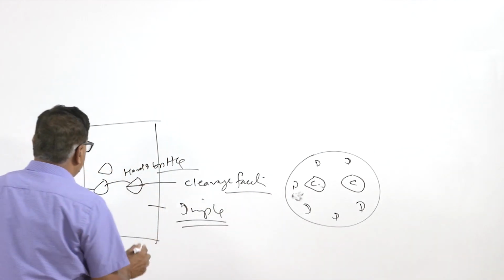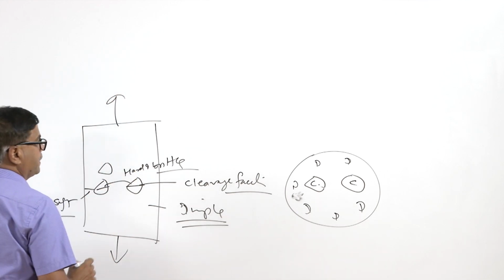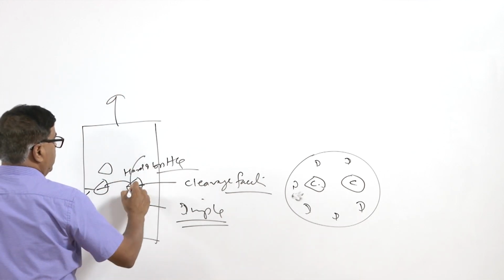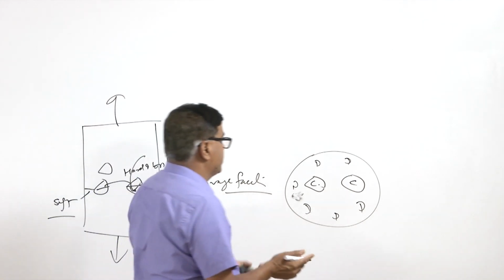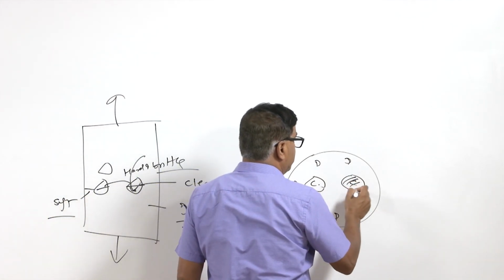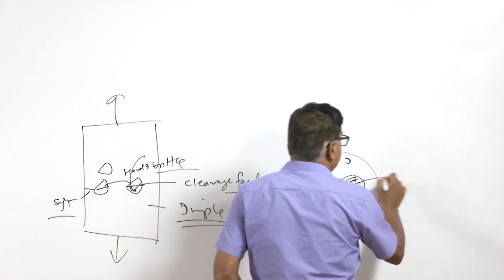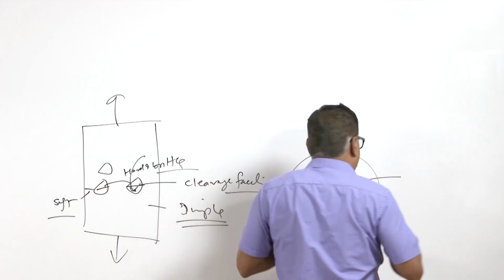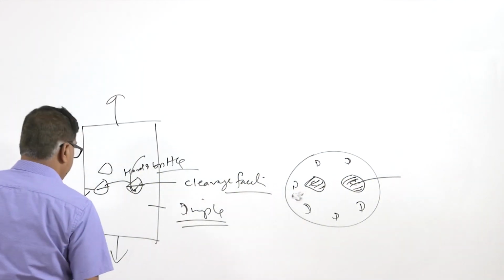And if, under the external stresses, instead of getting fractured, these particles get pulled out, pulling out will leave some vacant spaces on the fracture surface. These areas may look dark, and that will be the location from where these hard particles have been pulled out and have not fractured.